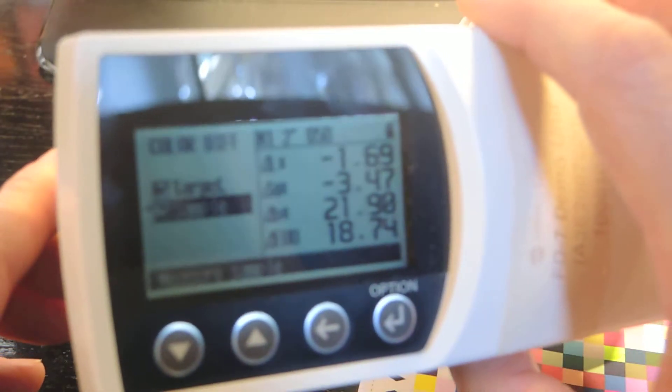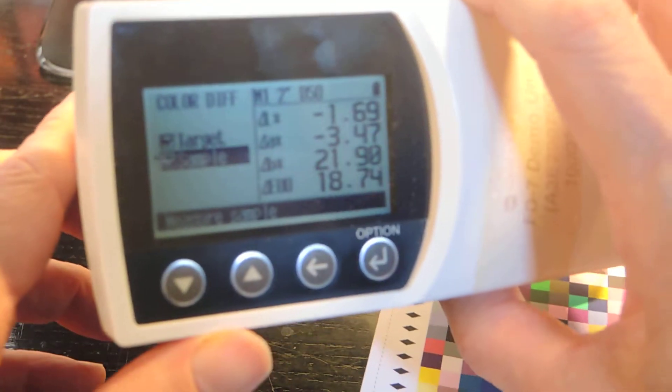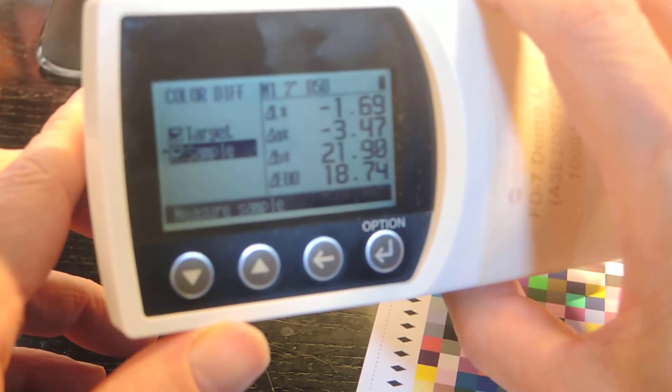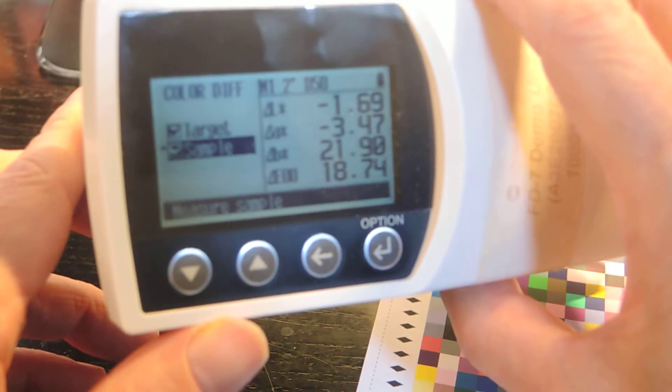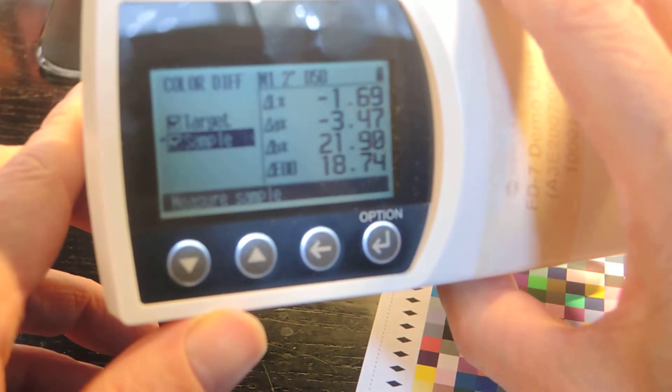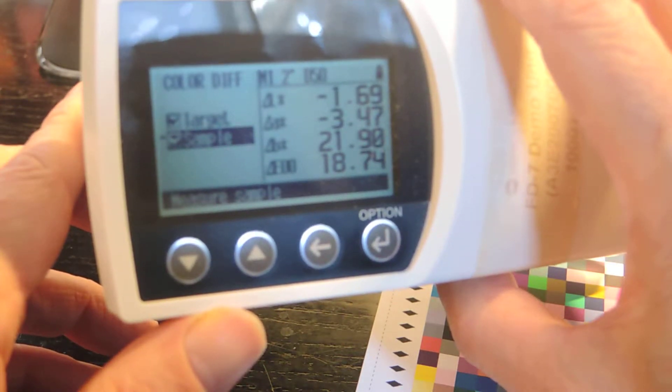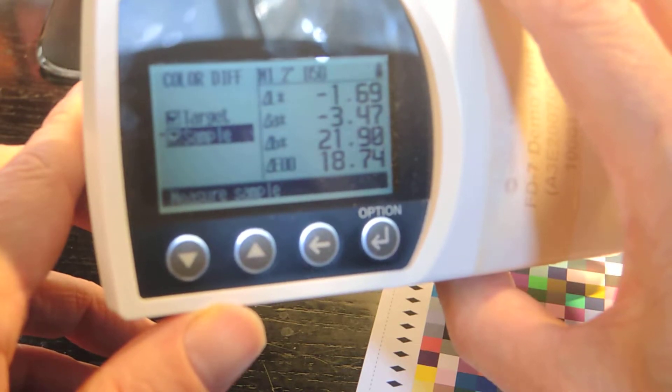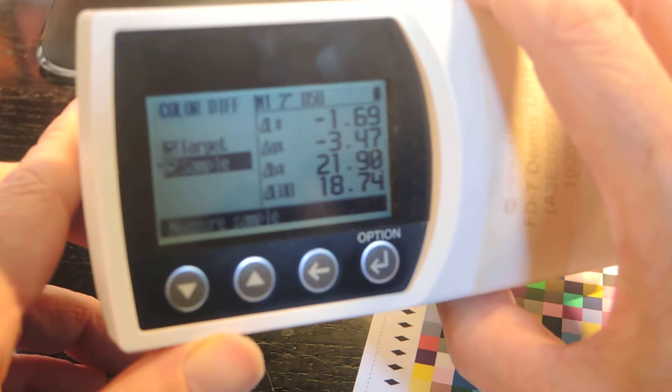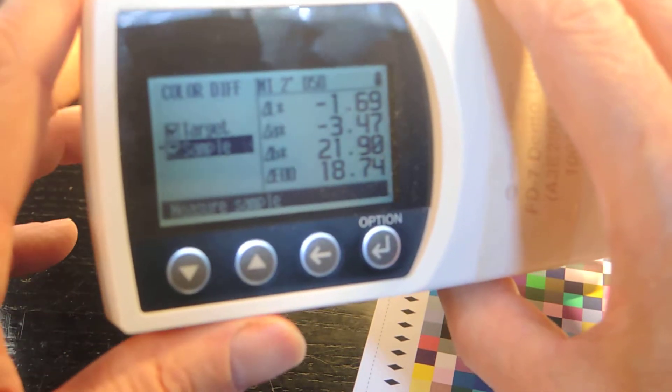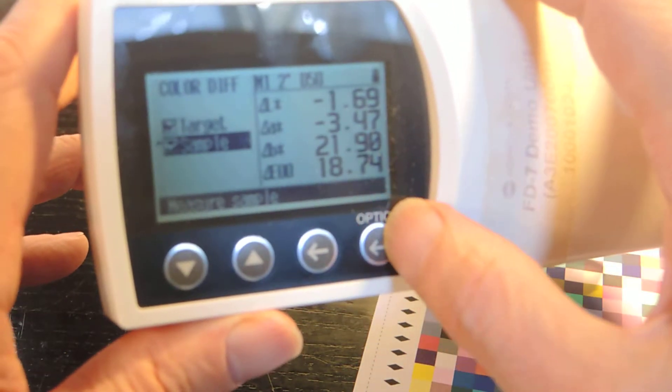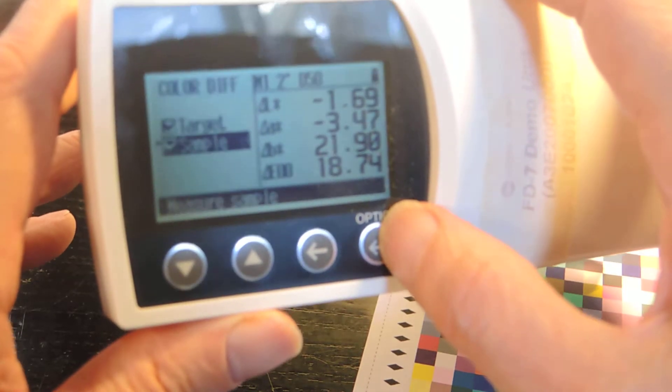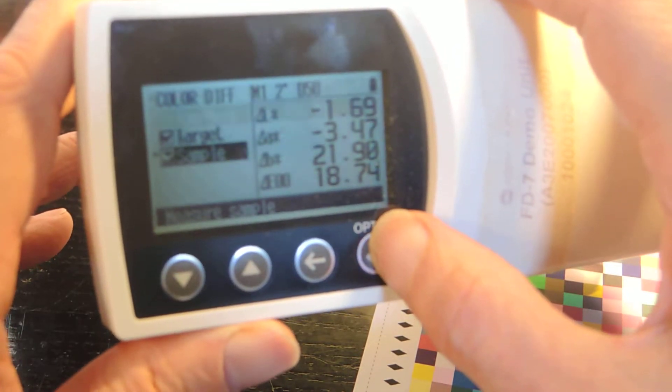And now let's see what the instrument says. The instrument says, I'm going to place it further away so hopefully the focus will be better. It says 18.74 Delta E 2000, and I suspect it's possible to toggle Delta E 2000 to other scales. Let's see if I can quickly get into that option.